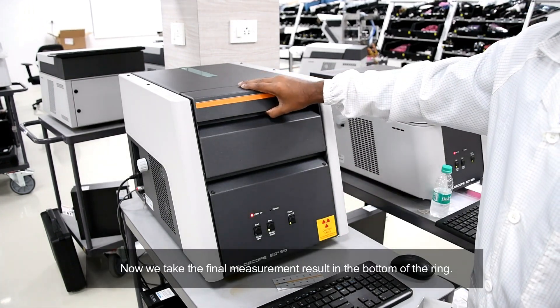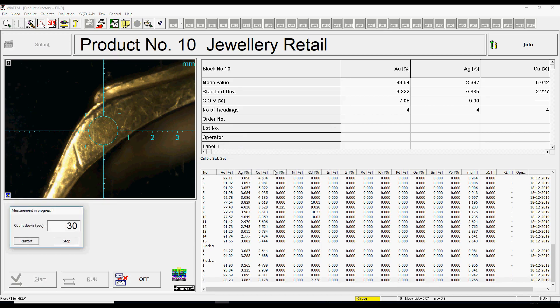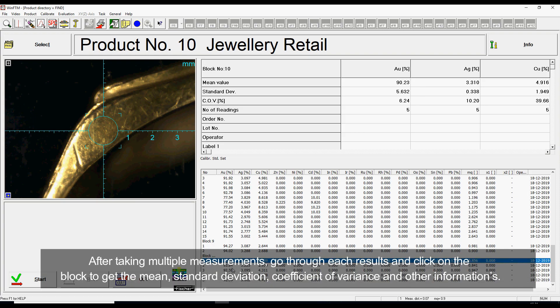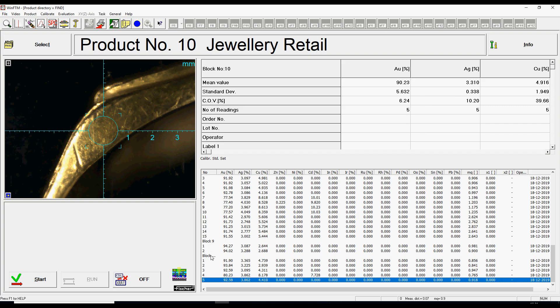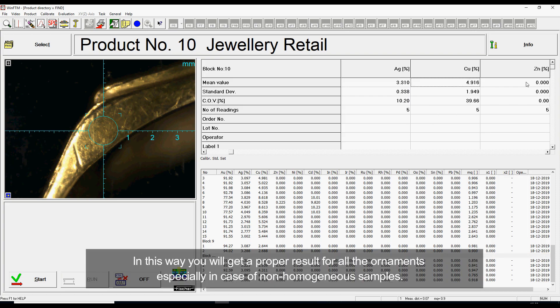Now we take the final measurement result at the bottom of the ring. After taking multiple measurements, go through each result and click on the block to get the mean, standard deviation, coefficient of variance and other information. In this way, you will get a proper result for all ornaments, especially in case of non-homogeneous samples.